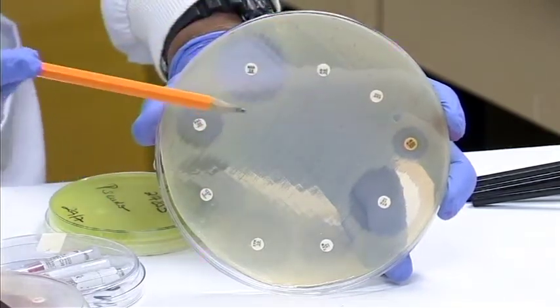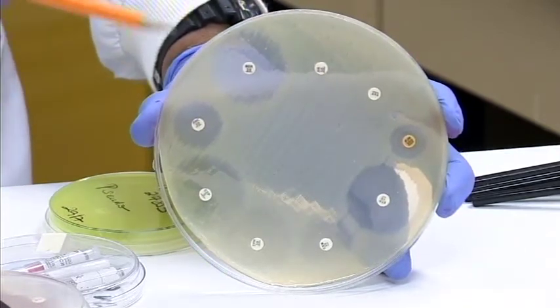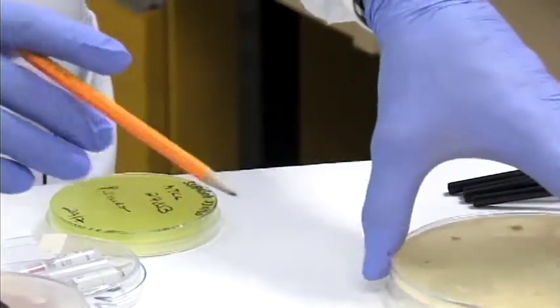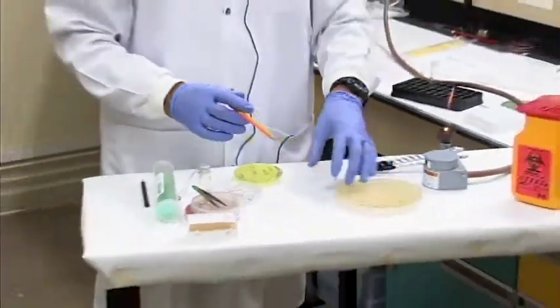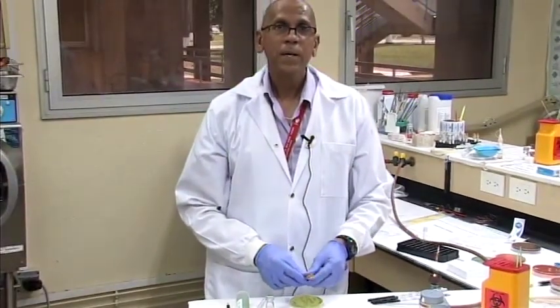Again, we compare it to a reference chart to see which drugs are sensitive, which are intermediate, and which are resistant. And then the microbiologist will recommend on our report form which drugs the physician can use for treatment of that pathogen in that patient. And this concludes the sensitivity testing.